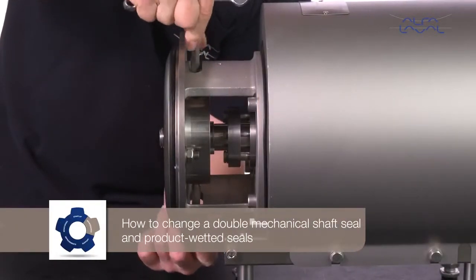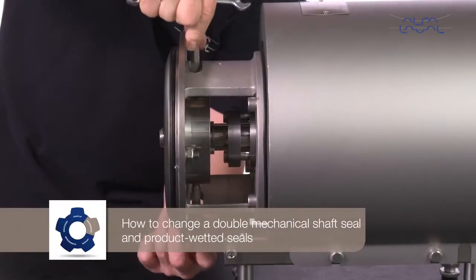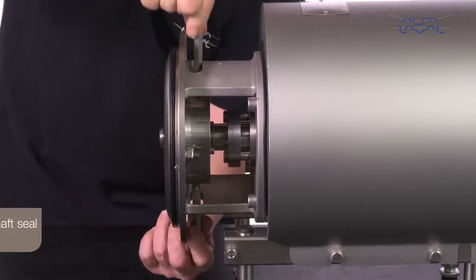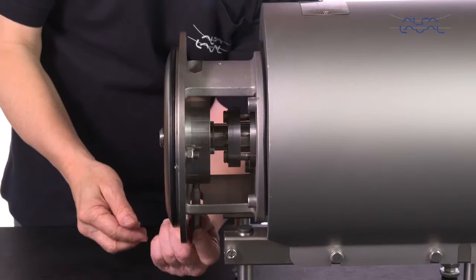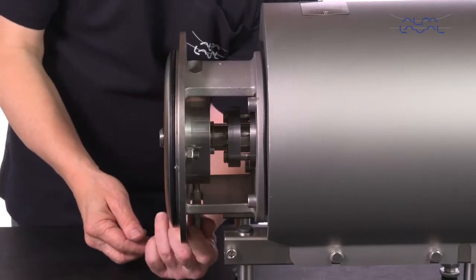How to change a double mechanical shaft seal and product wetted seals. Begin by removing the two flush connections. Unscrew the nuts and remove the washers, then remove the back plate.